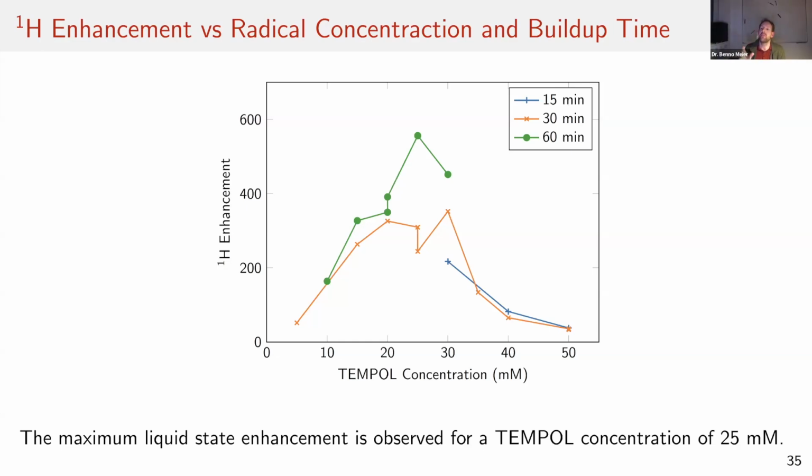Okay, so this sequence is for methyl. So it's a transfer from carbon to methyl protons. So they wouldn't exchange. We did, of course, yes, we did optimization. There have been studies of this kind before. There's a paper by Malcolm Levitt and Kevin Brindle. They used a different carbon, but transferred also to the methyl protons in the end. You can do all these things. You just take a lot of pyruvate, you do everything at ambient conditions, you optimize your sequence, and then you move on to the hyperpolarized experiment.